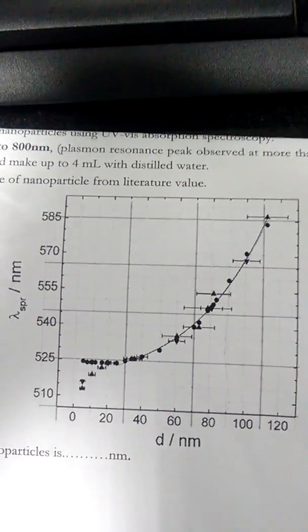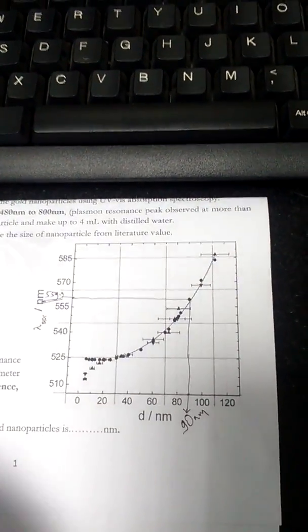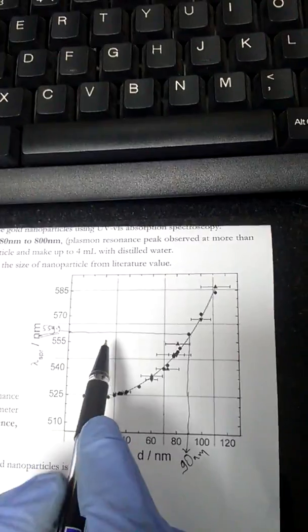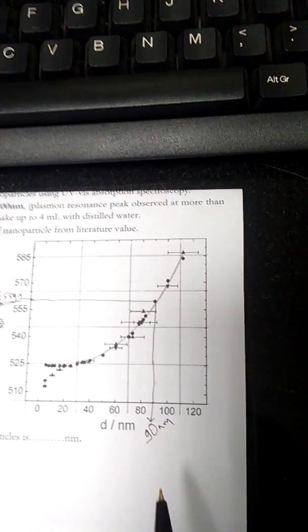To calculate the average diameter of synthesized gold nanoparticles from the graph, the average diameter of these gold nanoparticles is 90 nm.